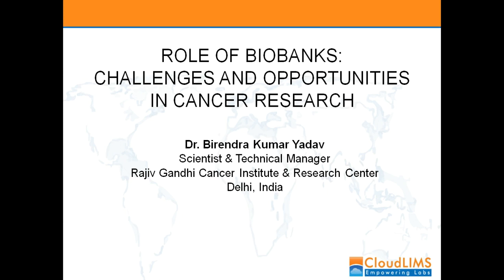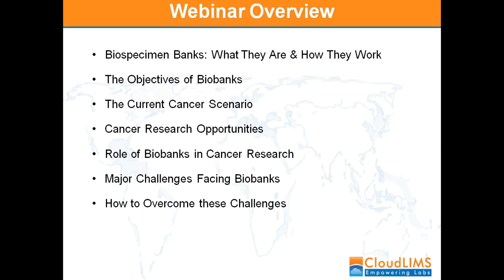I am humbled. Today I am going to share my views about the role of biobanks, challenges and opportunities in cancer research. We will cover the following points in our presentation. Biospecimen biobanks, what they are, how they work, the objective of biobanks, current cancer scenario, cancer research opportunities, role of biobanks in cancer research, major challenges facing biobanks, and how to overcome the challenges.